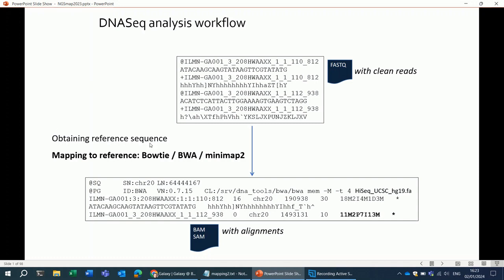Once you have the reference sequence, you can align your reads to the reference sequence. There are many tools for doing this, and the most used tools for mapping DNA reads are Bowtie, BWA, and Minimap2.